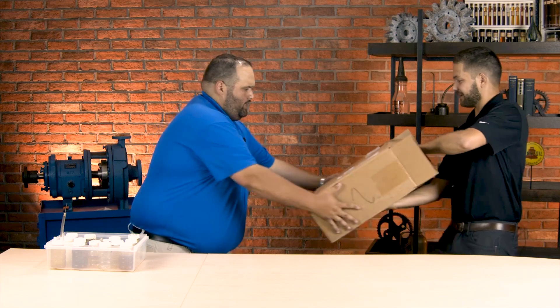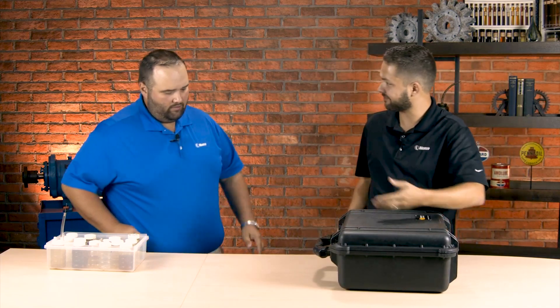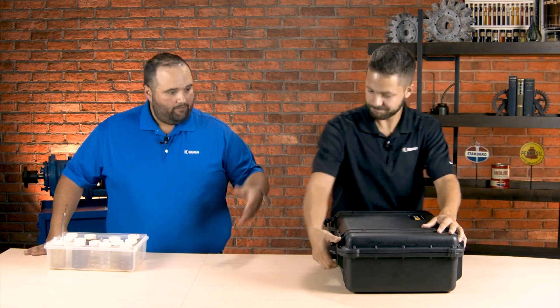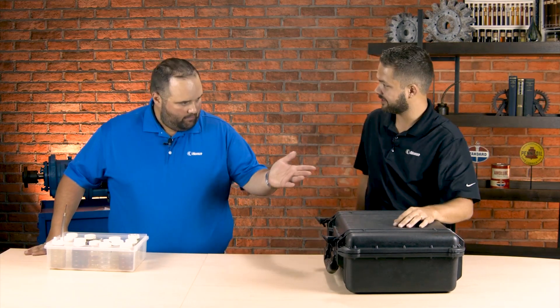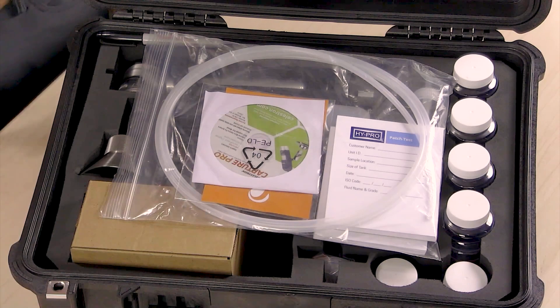Hey Wes, can you help me out here real quick? So this looks like the patch test kit I just got in from Hypro — Hypro Filtration. Yeah, Hypro — that's a company that makes obviously a lot of filters, a lot of different products related to that patch test kit, and they naturally make this as well. So this is a really great kit to do some oil analysis on site.